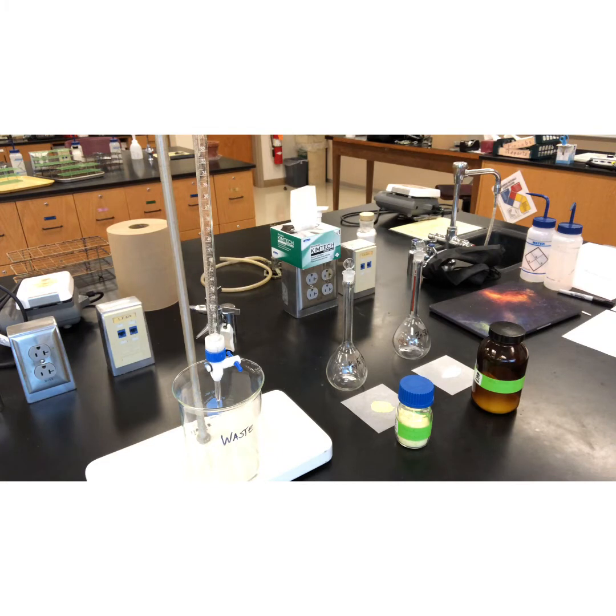In front of you, I have already weighed out those masses. You calculated an approximate mass, but I can't get it exactly. You should have calculated about 2.6 grams. I'm not going to stand there and weigh exactly 2.600 grams to get exactly that concentration.